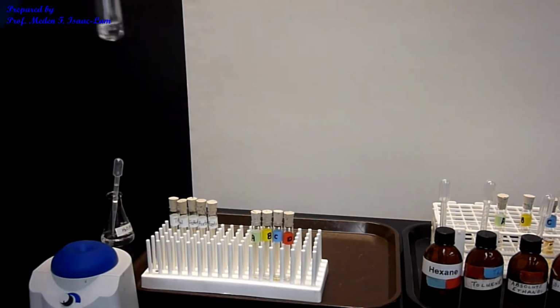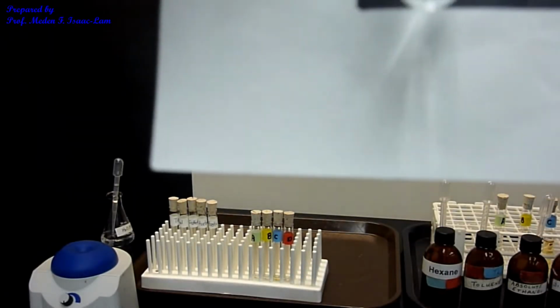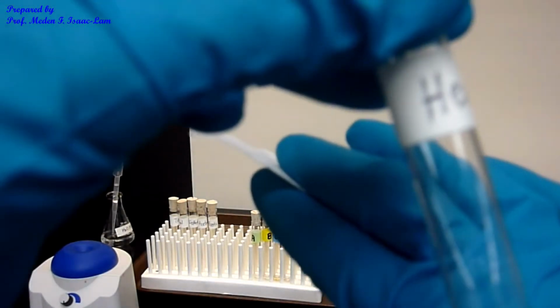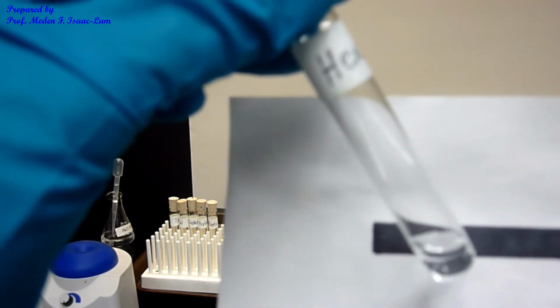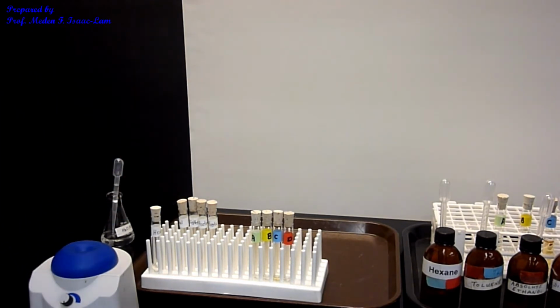So hexane over here. Is there a layer? Is it difficult to see? And now toluene.